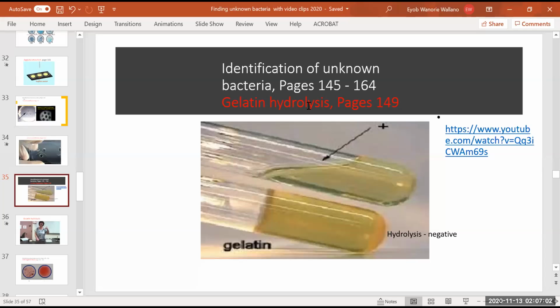It means certain bacteria have the gelatinase enzyme. That gelatinase enzyme is going to break down the gelatin. So for this reason, when you keep the bacteria at room temperature, around 68 degrees Fahrenheit or 22 degrees centigrade, or around 18 or 20 degrees centigrade, when the bacteria grows, it is going to melt it because it has gelatinase.